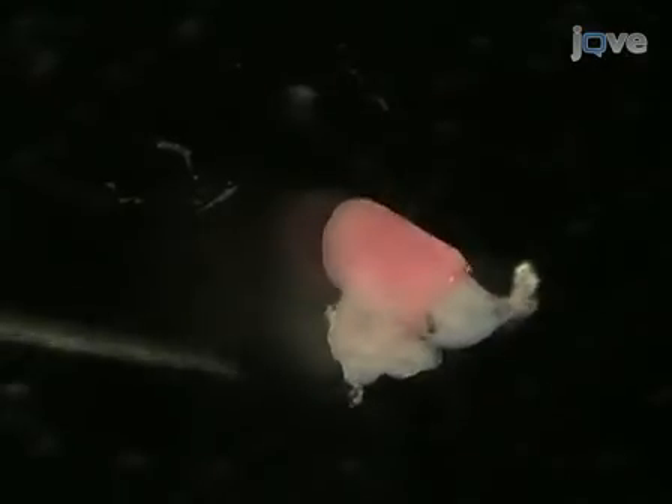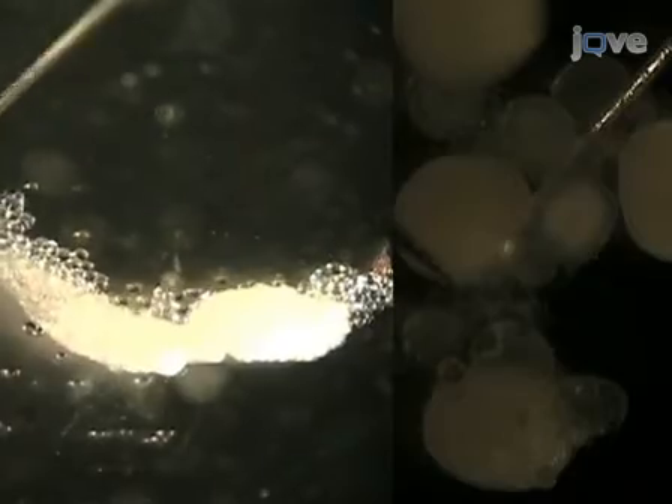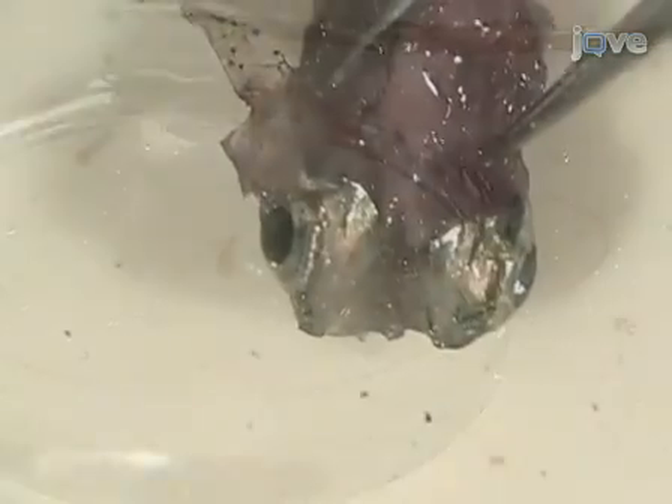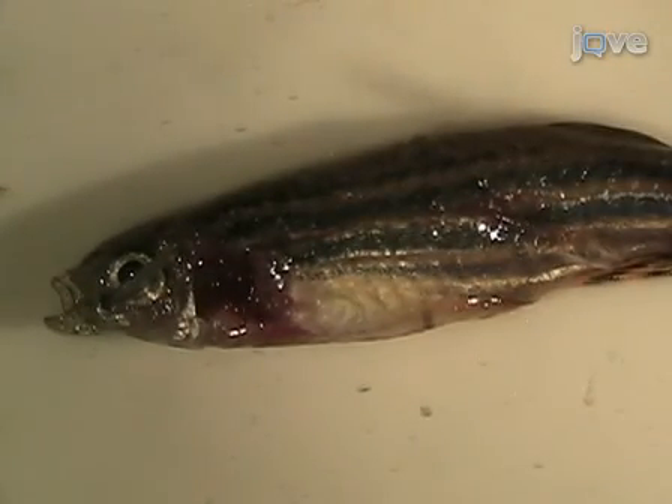The heart, gastrointestinal system, gonads, swim bladder, kidney, and brain were dissected from adult zebrafish. These organs can now be used for in-situ hybridization, immunohistochemistry, histology, RNA extraction, or other molecular techniques.